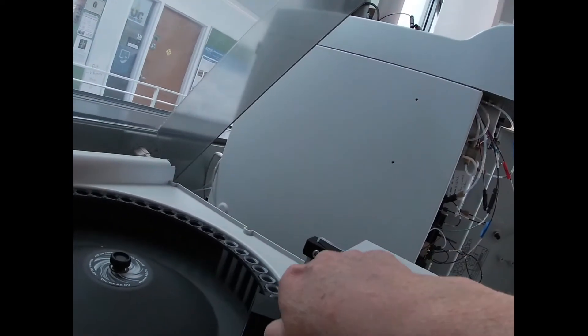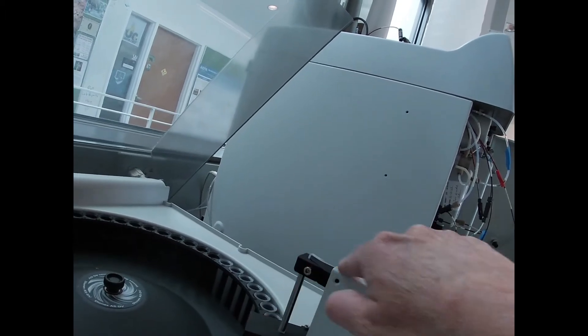So we have our autosampler. The autosampler can hold up to 50 samples. This plunger goes down and actually filters the sample right into here.